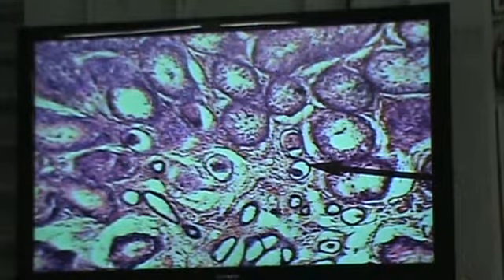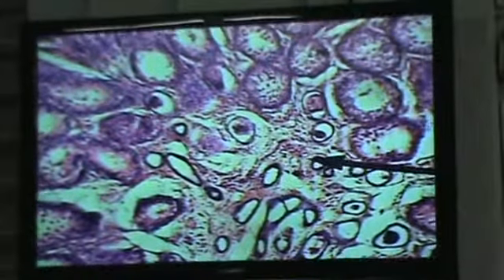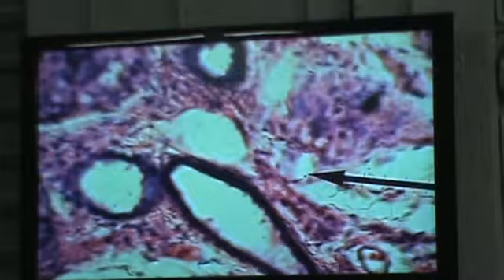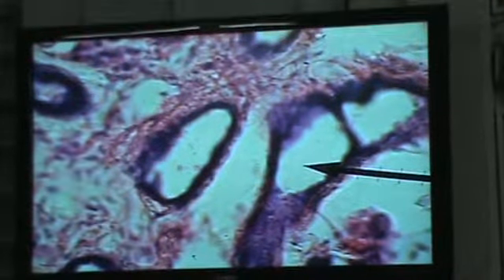Okay, what's wrong with that? Yes? Well, in that area here, so we're leading into the mediastinum testis, okay? And right here, in fact, look at this. Let's look right here. So right here, these are the little straight tubules. This is called the longitudinal section. Alright, so these are the straight tubules, lined by cuboidal type cells mainly.